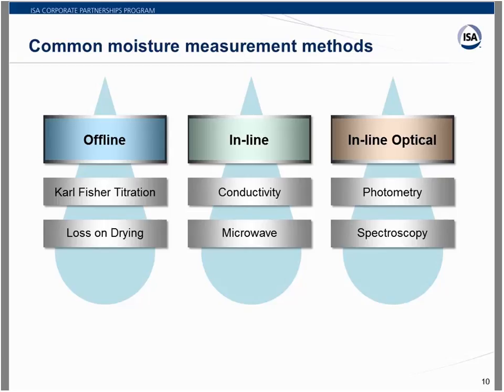And you have heating of the matrix. Once again, the microwave heats the moisture and gets it to go out of the matrix, but other volatiles that may be affected by the microwave will also disappear from the process and give you a false value for actual loss of water. Inline optical.